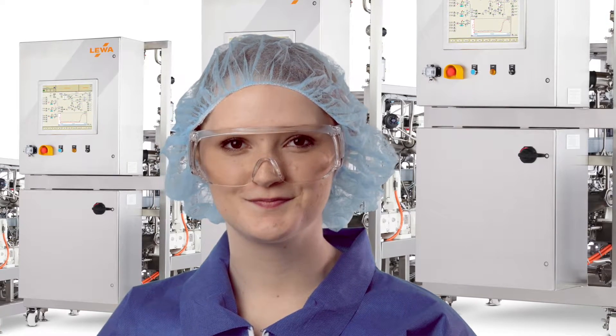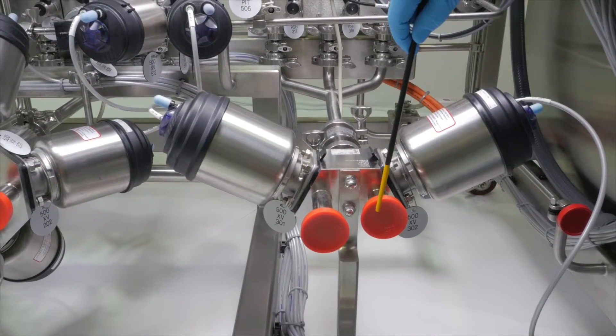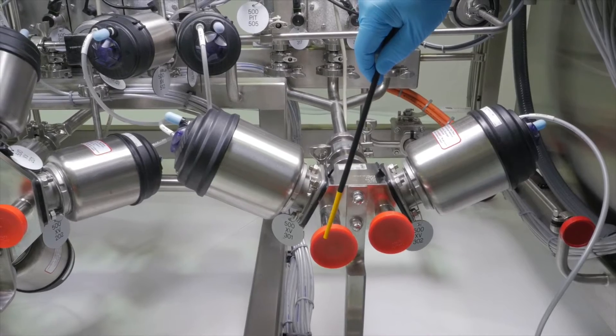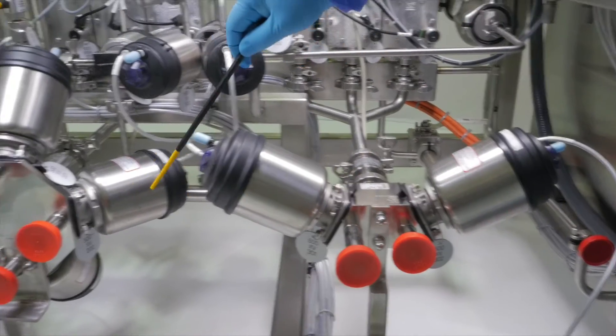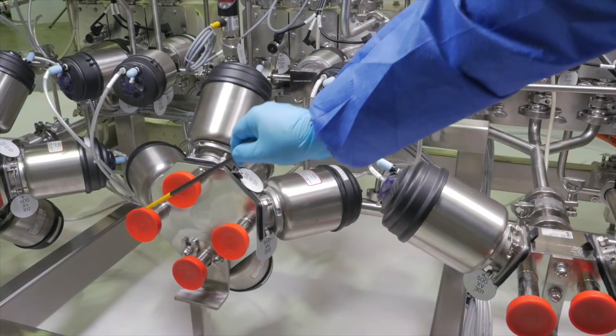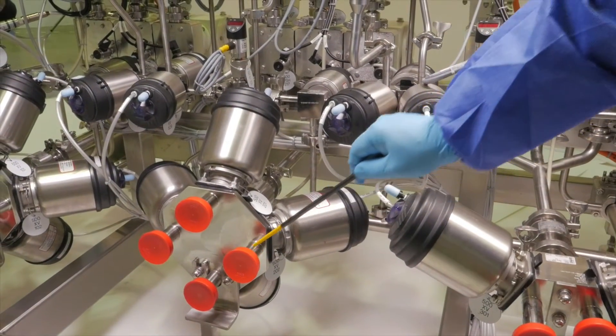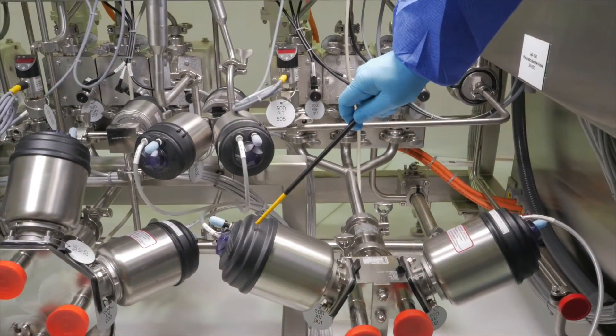So let's take a look at how the EcoPrime LPLC works. Buffers and feed solution enter through the inlet valves. Up to six valves can be selected for each pump. We use Berkert block valves that feature extremely low hold-up.